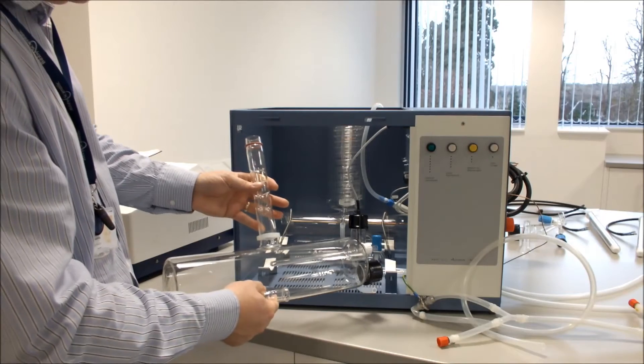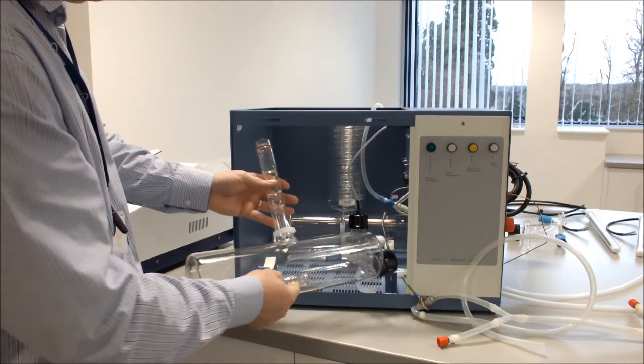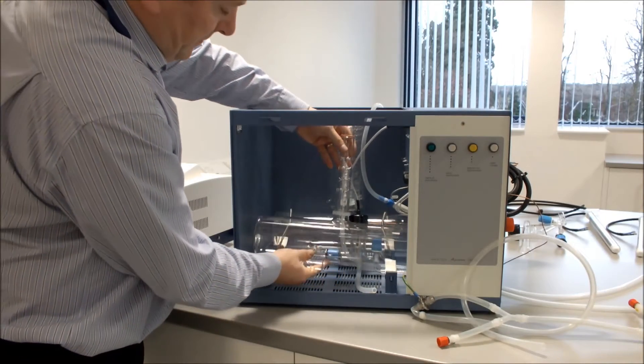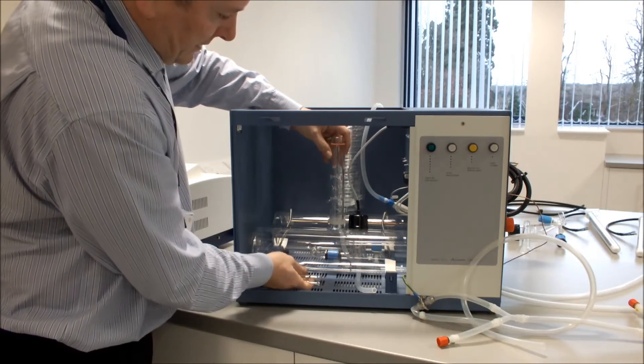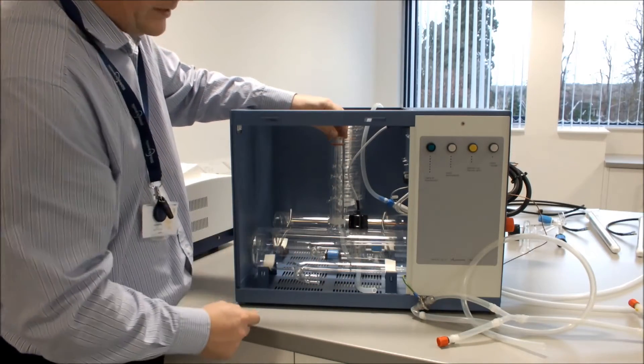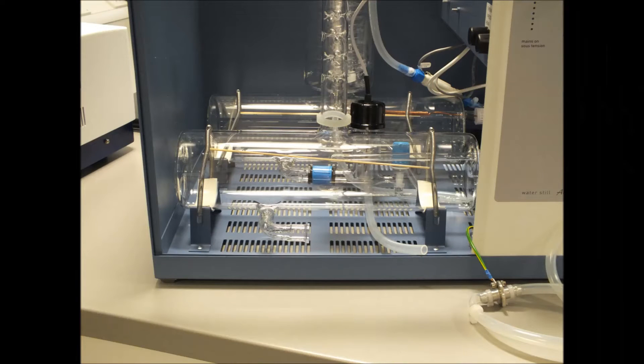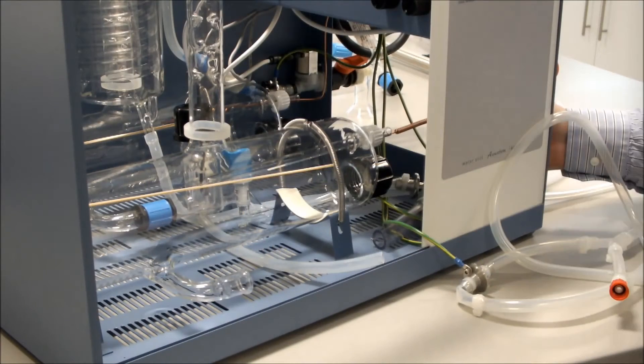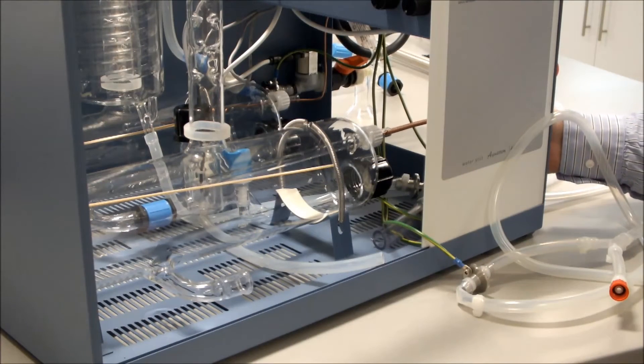Next thing to do is to refit our front boiler. So we put it in place like so and we will then retain it with our retaining springs. We then refit our thermostat into our boiler.